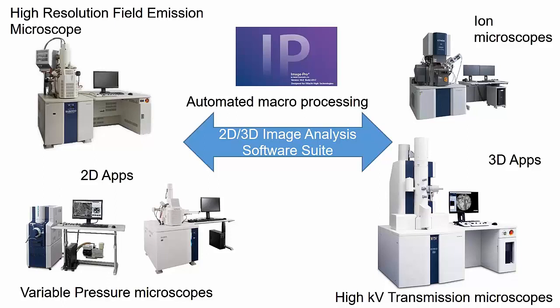I've encountered a lot of different labs and researchers that tend to use one software for one particular aspect and a different software for another aspect. ImagePro gives you all of that capability in one interface. That way, you only need to learn one type of software and you're done.